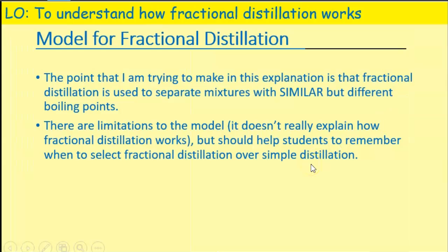So fractional distillation is mainly used in the crude oil industry to separate the different parts or fractions of crude oil. And it relies on all those different fractions having different boiling points. What we're going to look at today, though, is how we would use fractional distillation in a school setting. And that's to separate two liquids that have very, very similar boiling points. They've got to be different, okay, for them to be different liquids, but they are very similar.